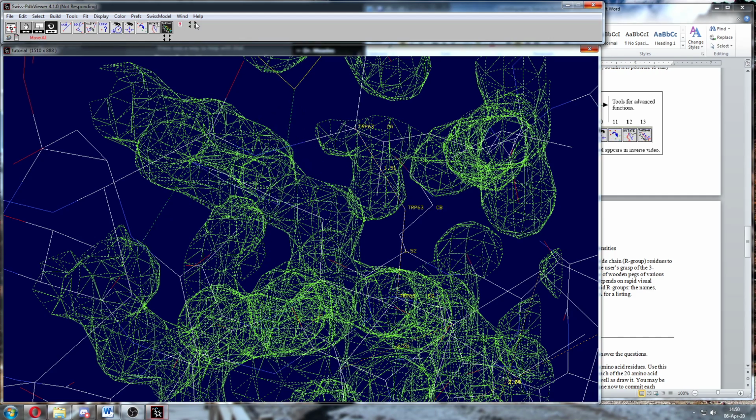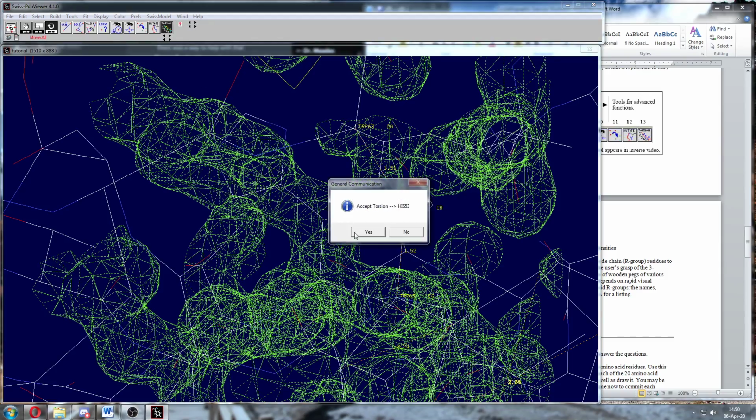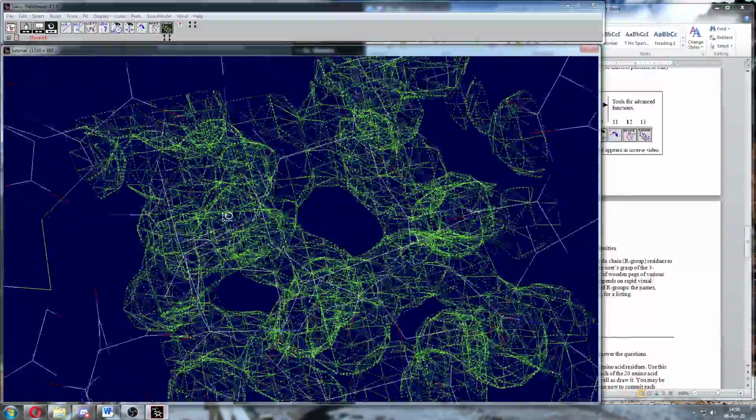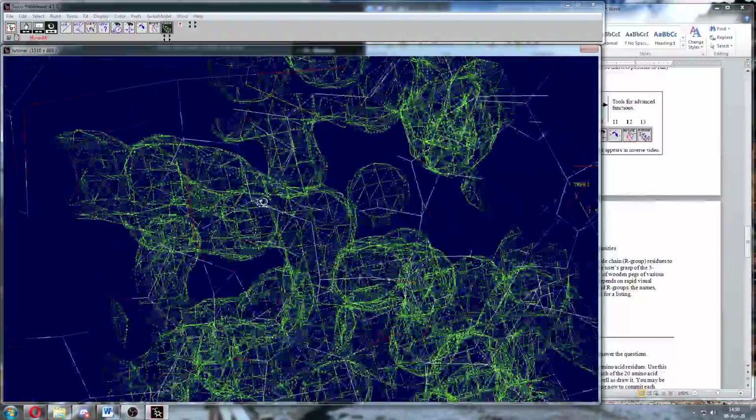And the faster your computer, the faster this goes. So I'm trying to go really slow with it. And of course I can rotate the ring. Okay. So I did some rotations, perhaps I changed it, hit torsion. Does it seem to fit better now? No, I clearly made things worse, right? It doesn't even fit remotely close to this.